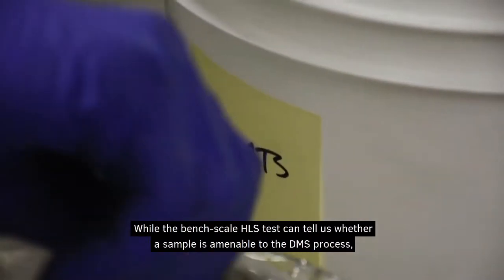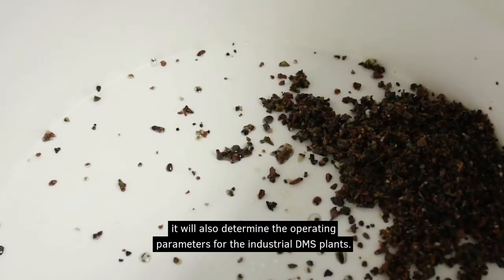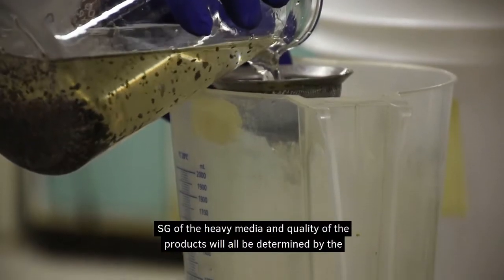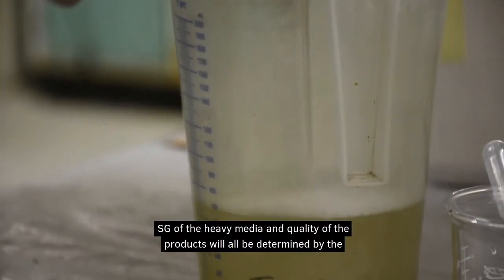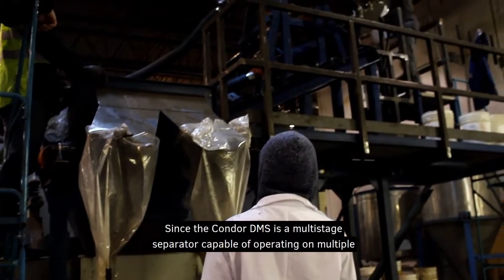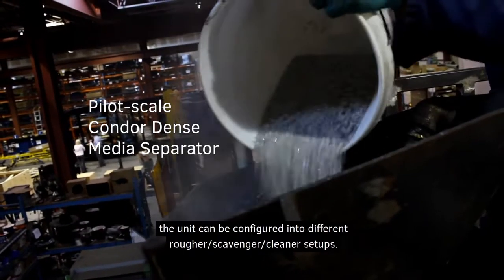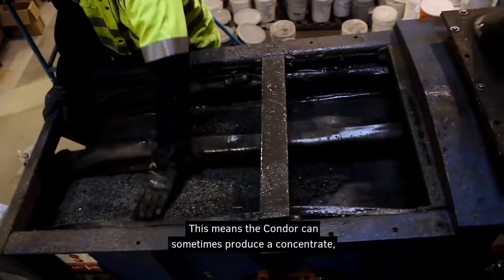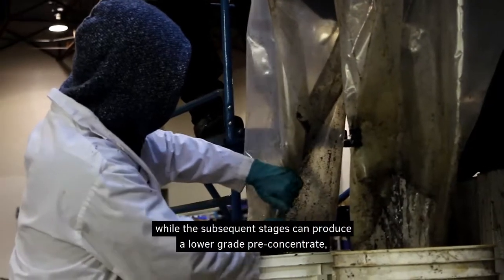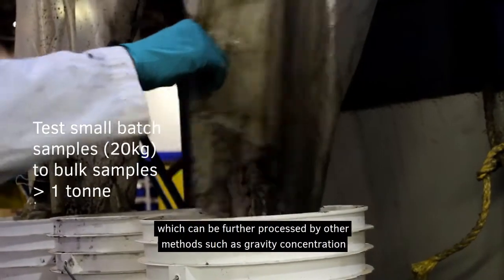While the bench-scale HLS test can tell us whether a sample is amenable to the DMS process, it will also determine the operating parameters for the industrial DMS plants. Factors such as crush size, SG of the heavy media, and the quality of the products will all be determined by the HLS test. Since the Condor DMS is a multi-stage separator capable of operating on multiple SG cut points, the unit can be configured into different rougher, scavenger, and cleaner setups. This means the Condor can sometimes produce a concentrate which immediately achieves target grade in the first separation stage, while the subsequent stages can produce a lower-grade pre-concentrate, which can be further processed by other methods such as gravity concentration and flotation.